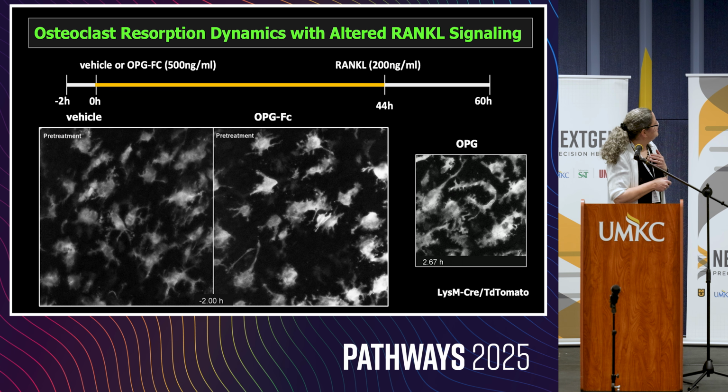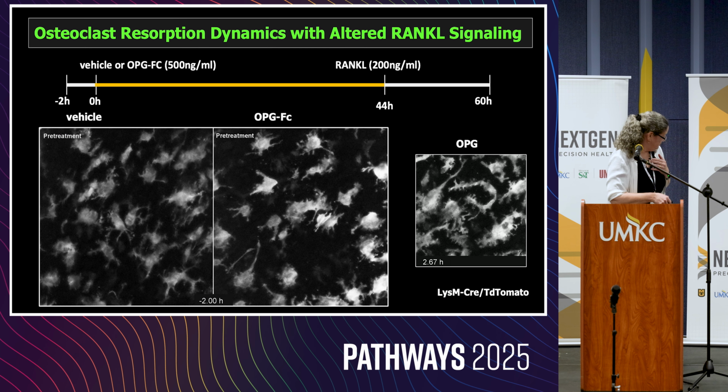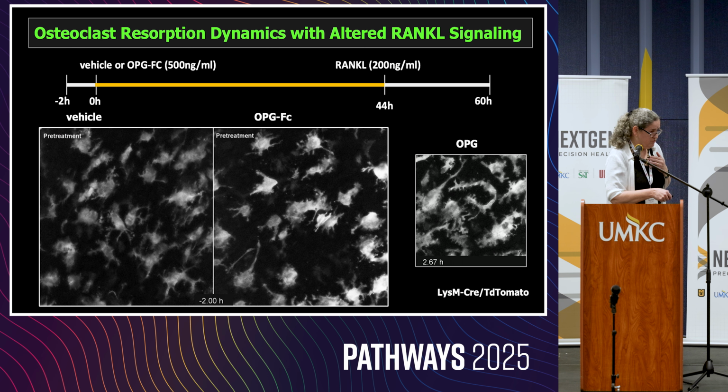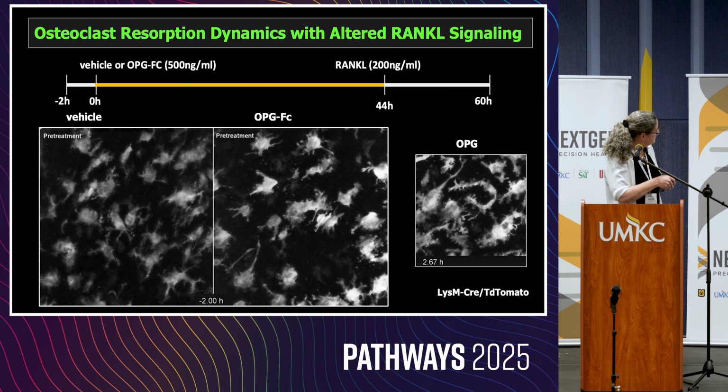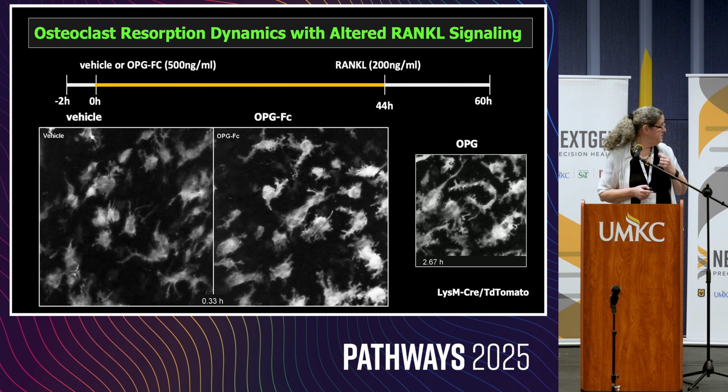I think it played a little sooner than I wanted, but I think you can see that even by just a couple of hours after treatment with this OPG, we're seeing this dramatic change in the shape of these osteoclasts. So the treatment period will be 44 hours. If you could restart the movie there.